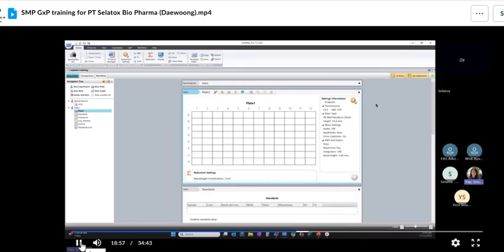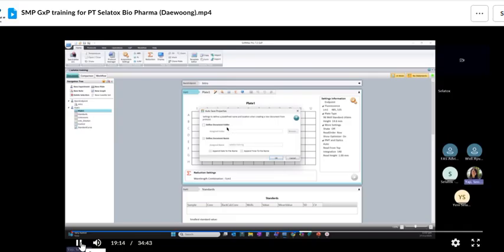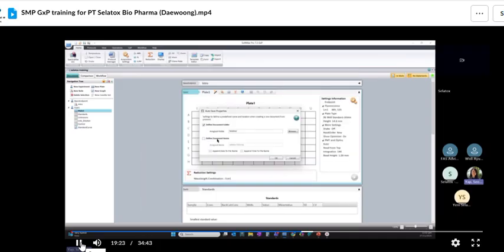So as a scientist that creates this file, what I really need to do, before I create the statements, is also make this file consistently save, or auto save, or auto export. You can auto save here. I suggest you turn this on. Go to auto save and define which folder you would like to save to. So I'm going to save this. You will see that later.